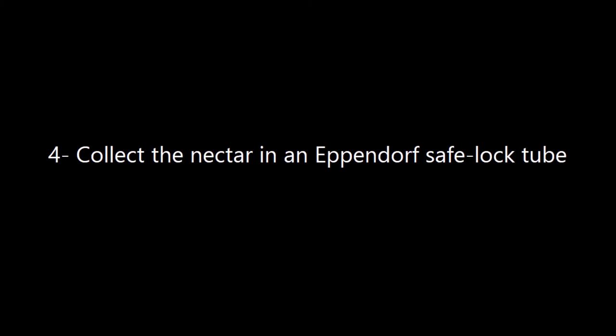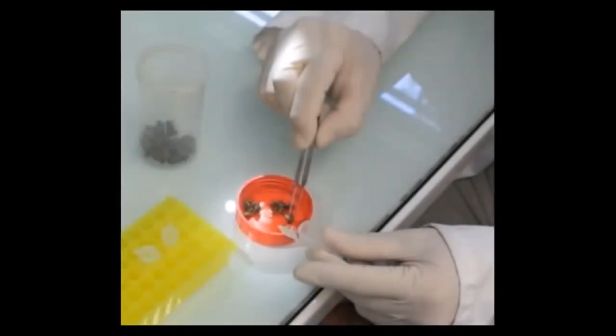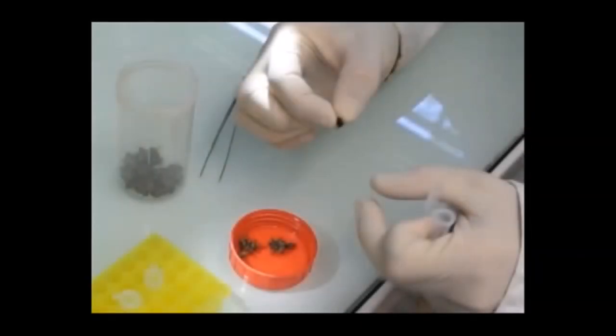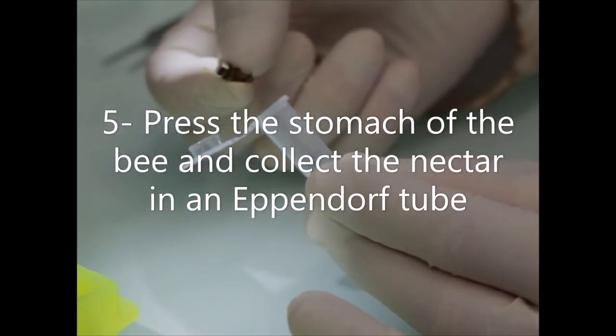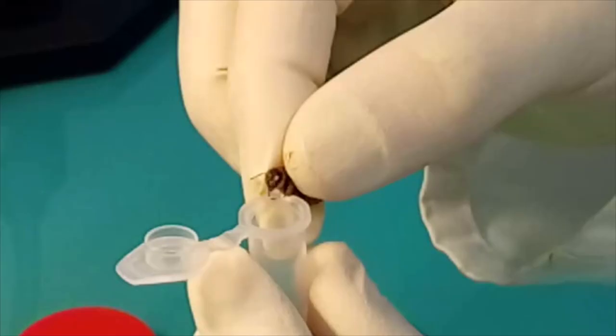Nectar was collected in Eppendorf SafeLock tubes. Bee stomachs were pressed, and the nectar was thus collected in an Eppendorf tube.